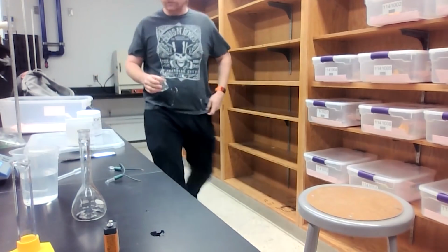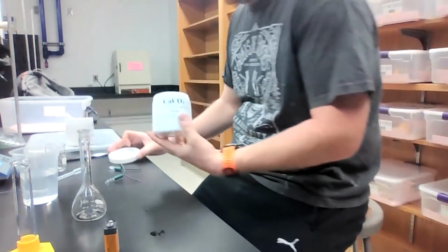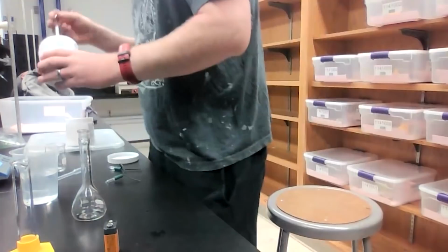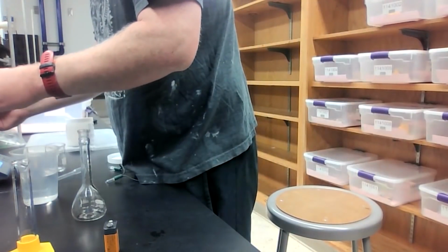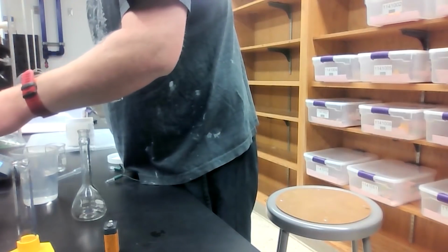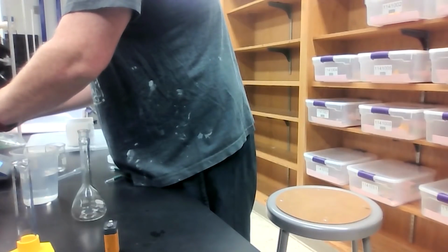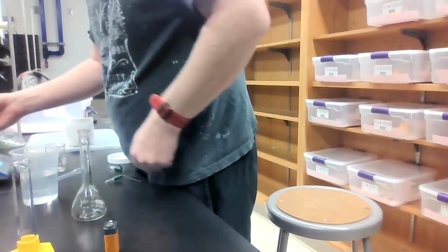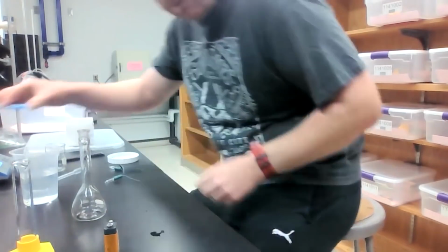Okay, so the last solution that I'm going to look at right now is my calcium carbonate solution. I'm going to get 1 gram of it. I got 1.06 grams of it.